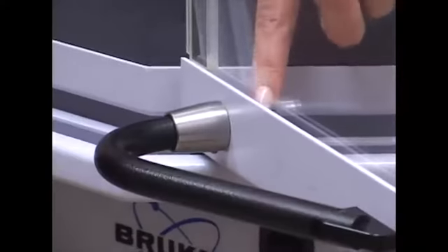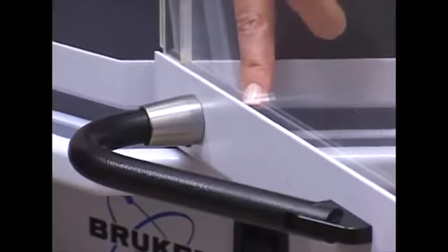Radiation doesn't travel very far, it doesn't travel through thick objects, and it doesn't travel through lead. So these are leaded glass, and they have little pins in the handles that will engage mechanical switches right in here in the door. And then there's also electronic switches in the door in the bottom and the top. What this does is ensures that when you close the door, all the switches have engaged correctly and that the door is correctly closed.